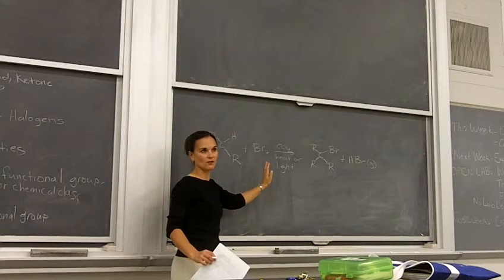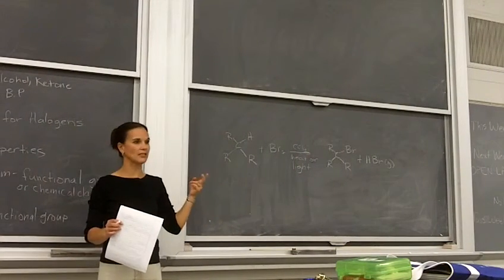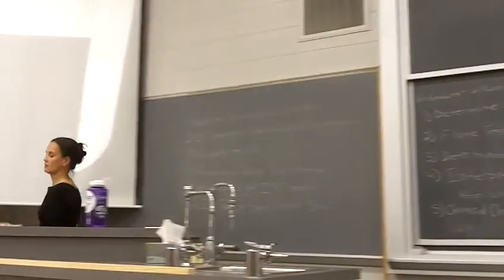Don't use those results alone, all right? Now the thing with the bromine test is you actually need a second test to be positive in order to say it's an alkene. And that second test is the potassium permanganate test.